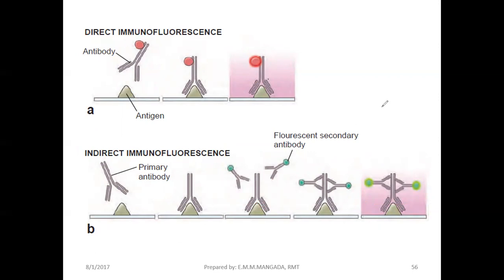Again, different types of labels that we can use. We have radio labels, radioactive labels. Pwede yon. O kaya naman fluorochromes. O kaya naman enzymes. Okay? O kaya naman mga latex particles. Okay? So you will know more of that pagdating nyo, guys, sa immunology and serology ninyo.